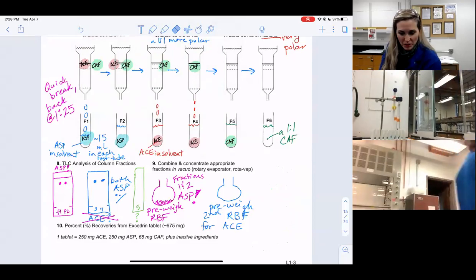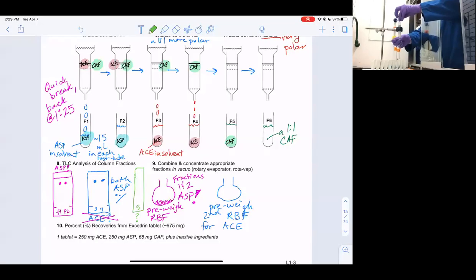Okay, so I just wanted to do a quick little check-in. We completely ran out of solvent. Some is still a little bit in the column, but it stopped dripping, so we're just going to recap the column at this point. We're not going to sit and wait for everything to make its way through. At this point, we're set up to do our last TLCs and then start taking down everything else that we need. So I'm going to transfer this over to Victor, and he'll do the last TLC. We'll see how those plates look.